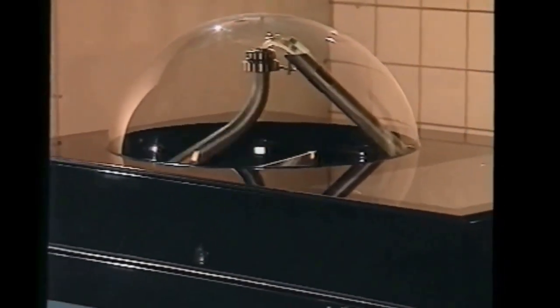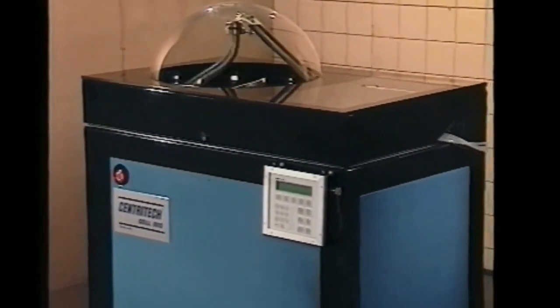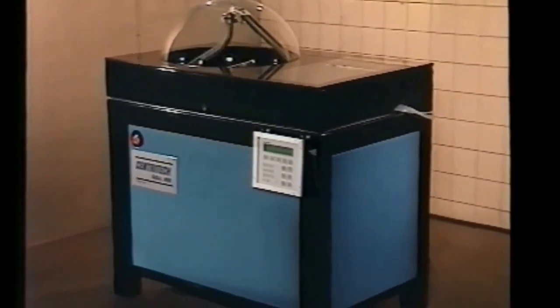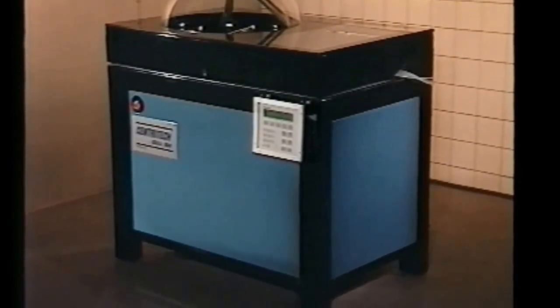But the problems are creating a totally sealed system and producing the desired degree of separation without the severe shear forces inherent in high-speed centrifugal operation.